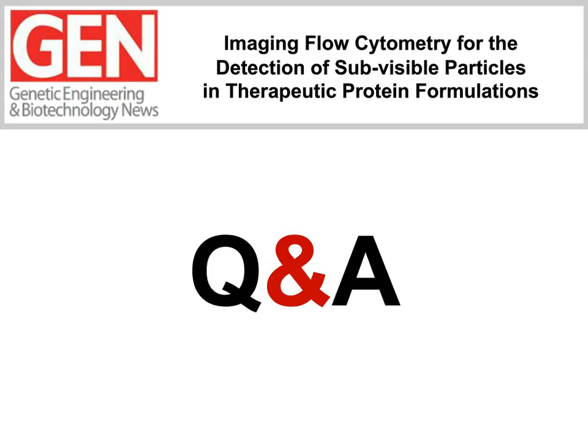Okay, thank you. And I think this is going to be all we're going to have time for. One last question for Christine. Christine, did you ever try to measure protein aggregates using imaging flow cytometry without using fluorescent dyes?